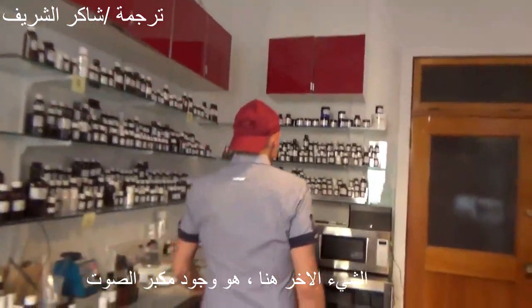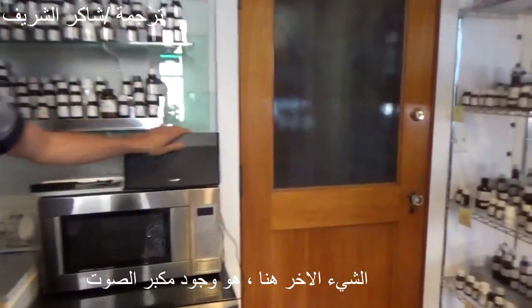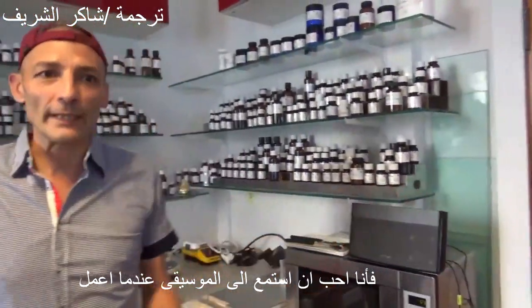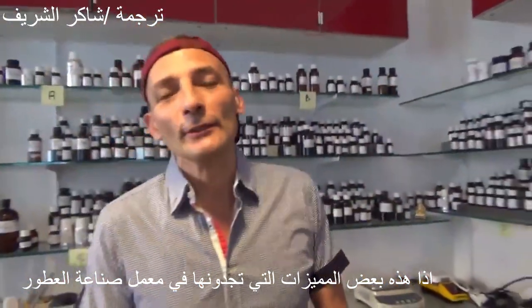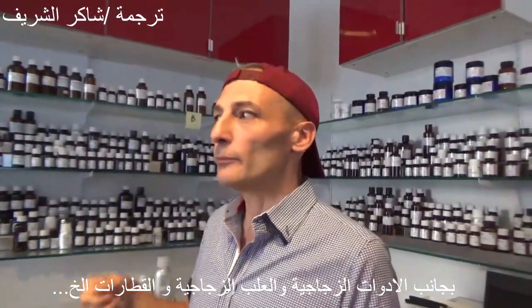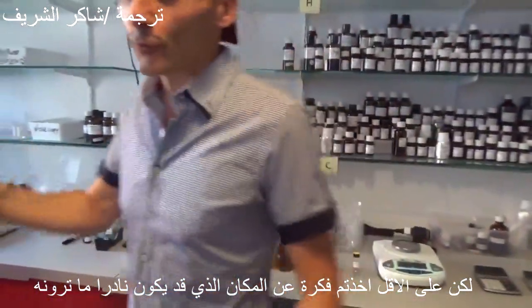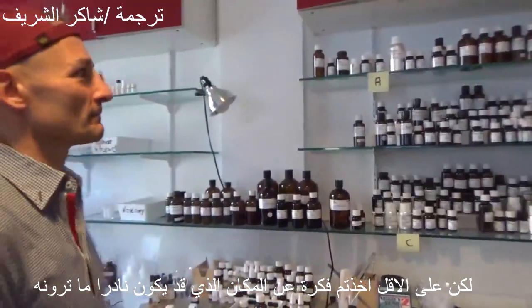And another important thing, at least for us at Dream Air, is a speaker. I like to have music many times when I create. So these are some of the features you can find in a perfumery lab, besides all the glassware, the bottles, the pipettes, etc. But at least you have had a little tour of something that is actually quite rare to see.